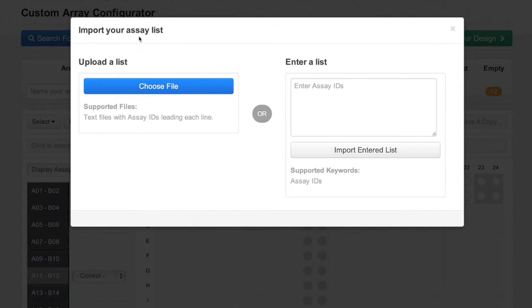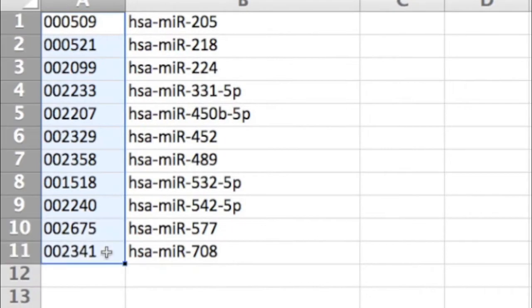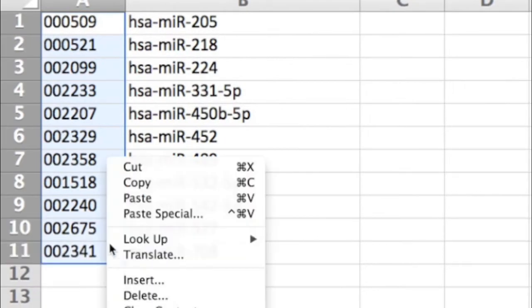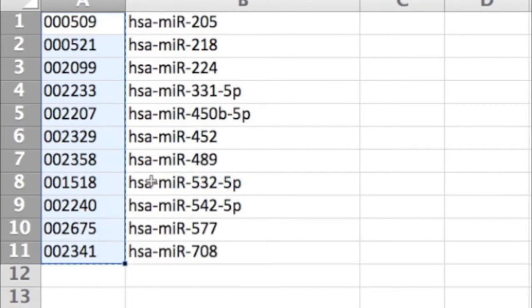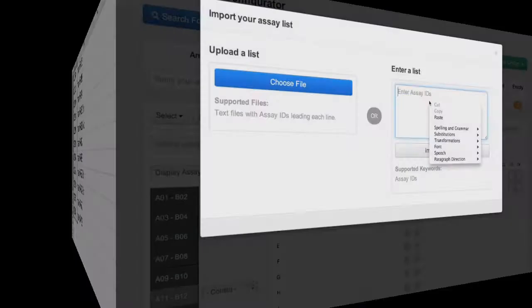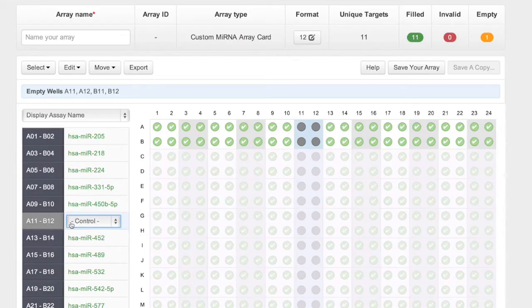You can upload a list of assay IDs using a TXT file format, or simply copy and paste from an Excel sheet or TXT file. Click the Import button and the assay list will be populated automatically.